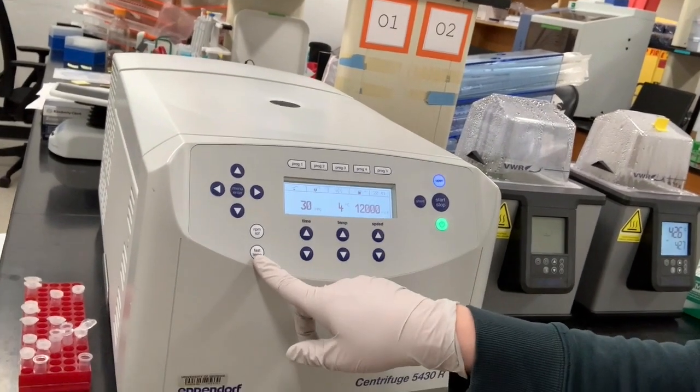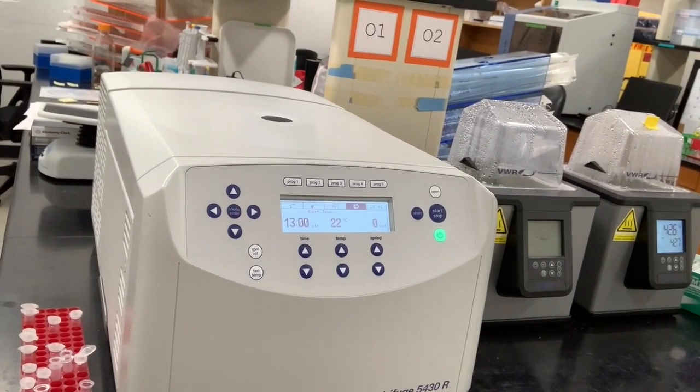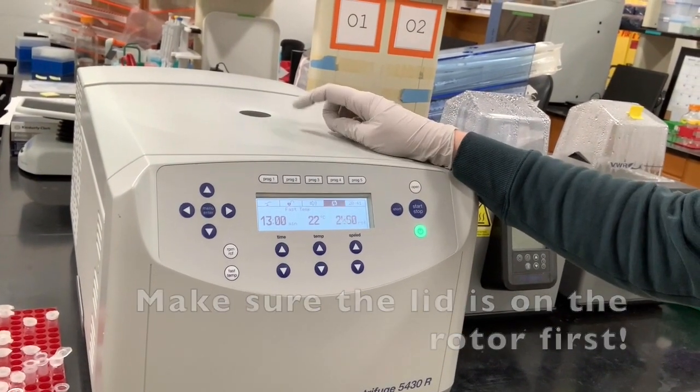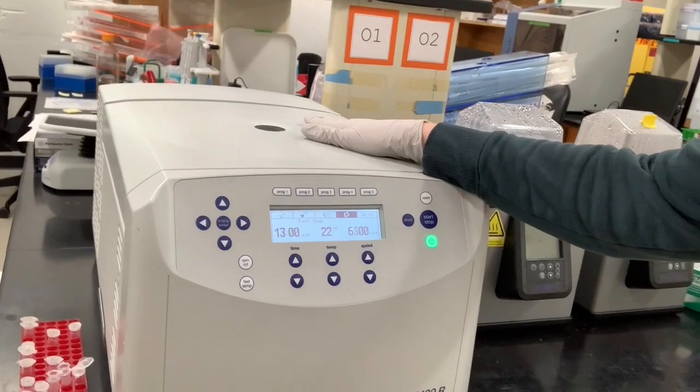And then there's a button that says fast temp. And if you hit fast temp, you need to make sure that lid is on the rotor. But this centrifuge will go through a spin to cool down to 4 degrees. That takes about 13 minutes. So it's a great idea to set up that cold centrifuge before you're ready for it. If you waited until the end of the incubation to cool the centrifuge, you'd have to wait even longer.